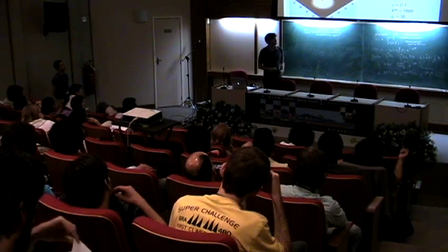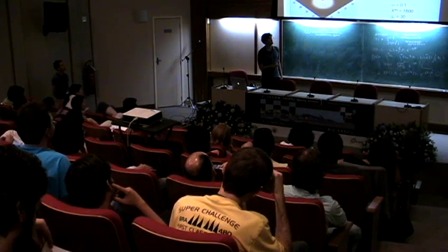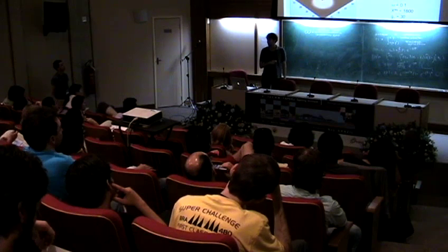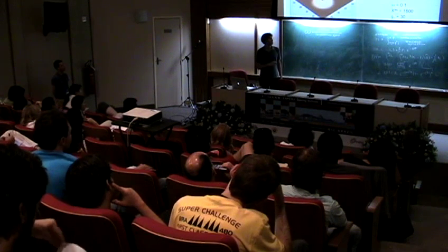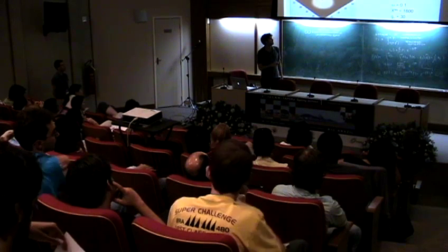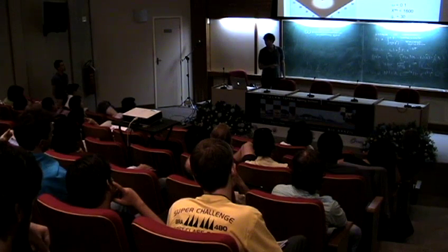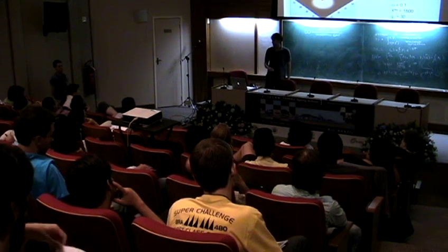If we had a good switch, we wouldn't have any of this over here. We would have this peak over here, and we'd be watching this for like an hour, and it would just be hanging out over here, and eventually through fluctuations it would come towards the origin over here, and maybe come over here. That is what we would see in a good switch.